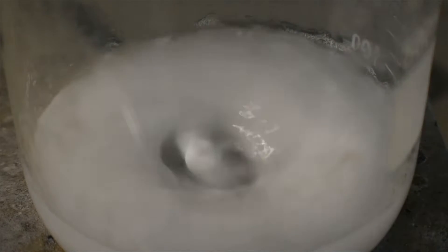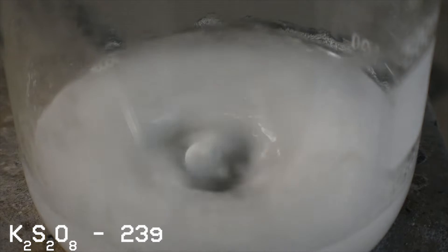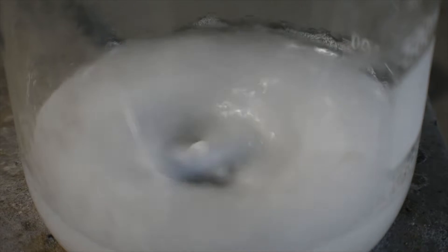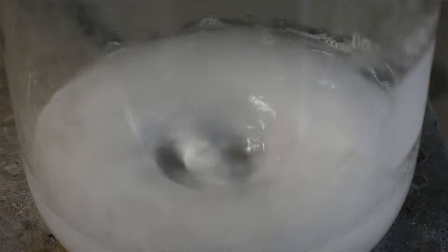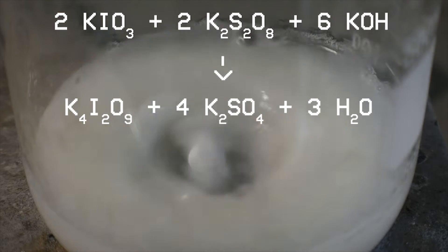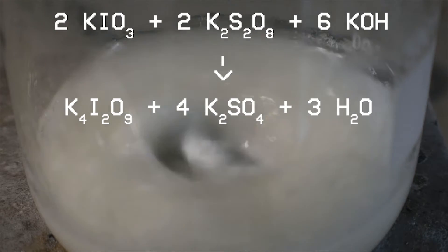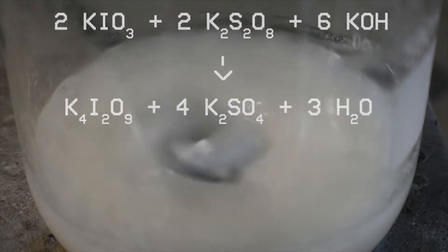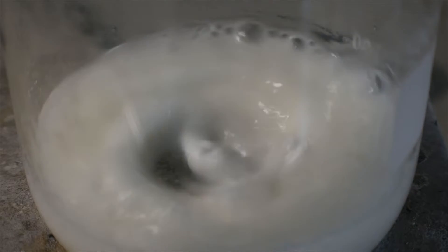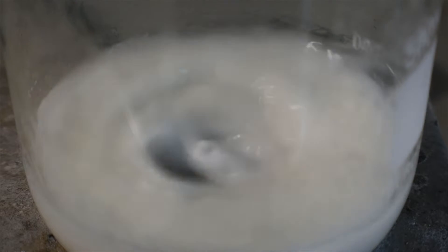Next, 23 grams of potassium persulfate are added to the hot liquid. This may dissolve, and some gas may be evolved, but it shouldn't be too much. You may see a slight color change to a yellow or tan color, and this is normal.